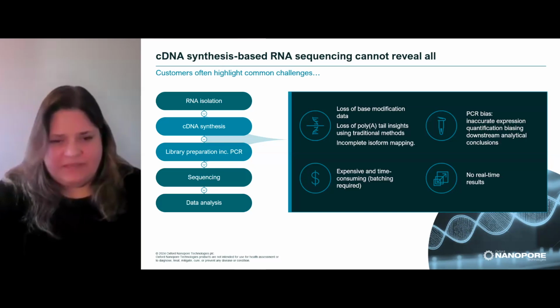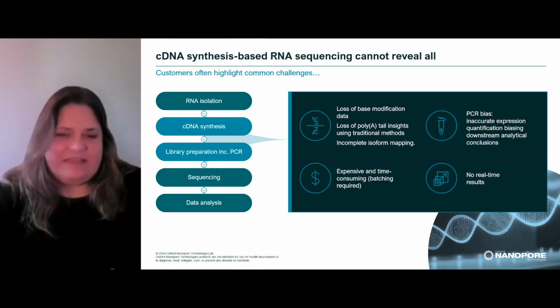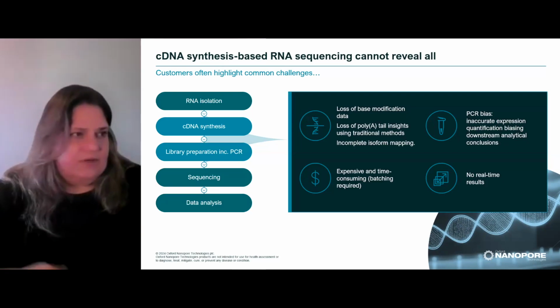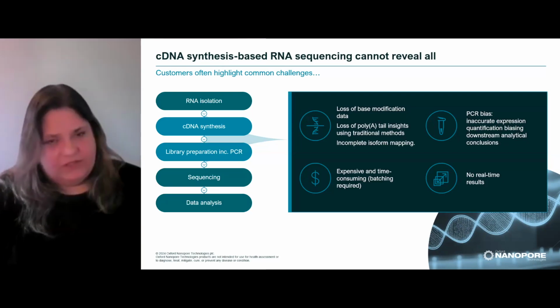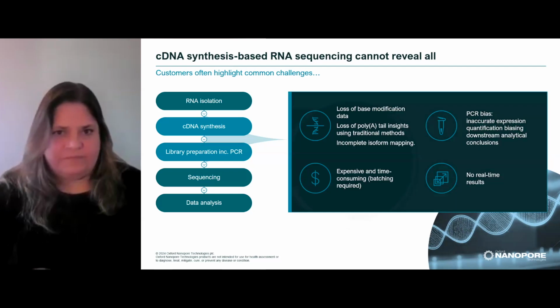It can also be expensive. It can be very time consuming depending on the prep that you're doing. And then you also get a long time to wait for real-time results if you're using specific platforms for sequencing. So while it's good, it's not always full information that would reveal what you might want to know from your particular RNA sample.